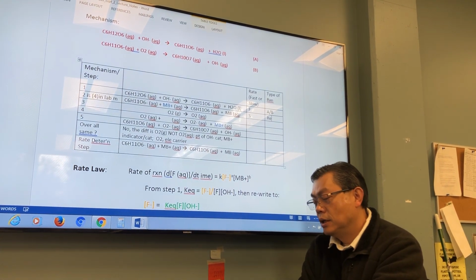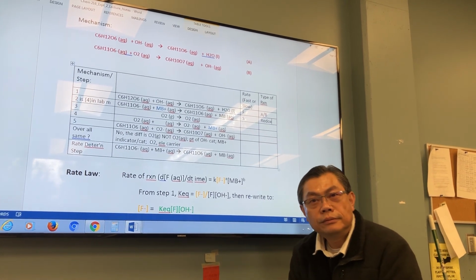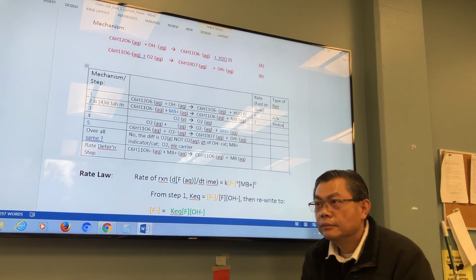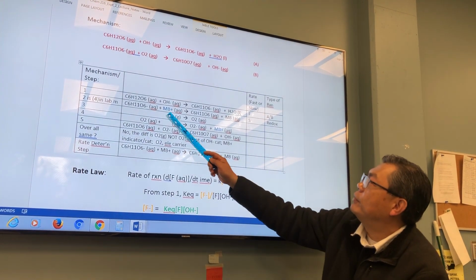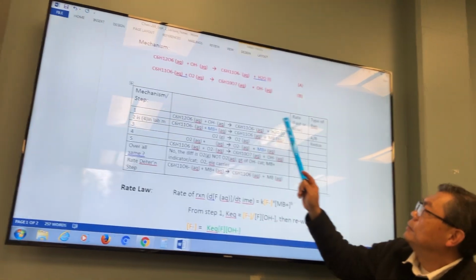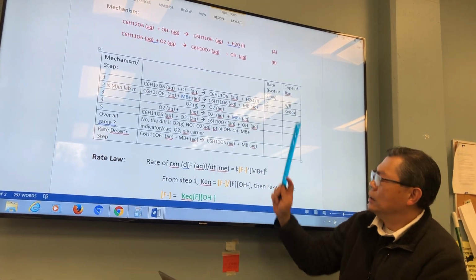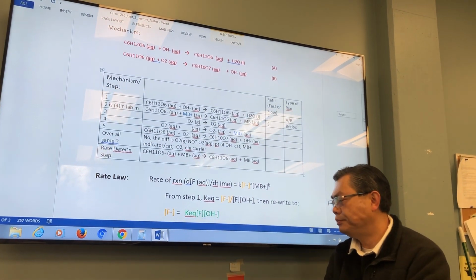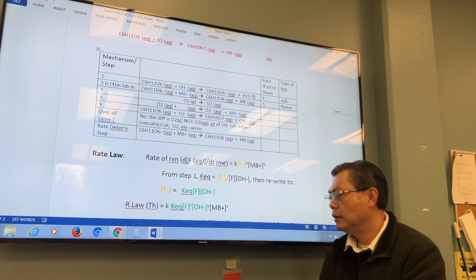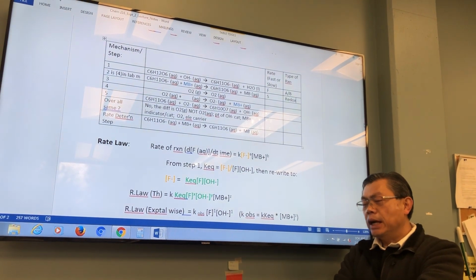So, redox. Are we good? So we've been timing the methylene blue plus being reduced. Is this okay? So we've been timing this step.